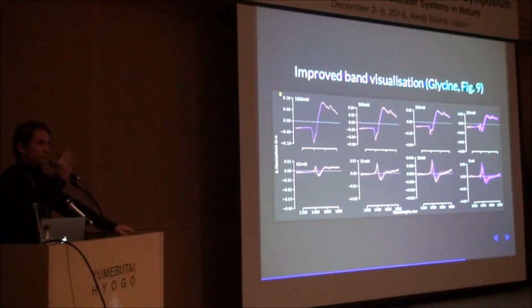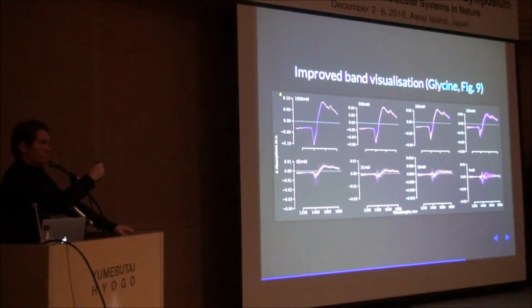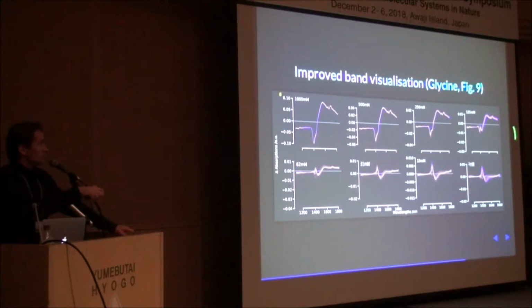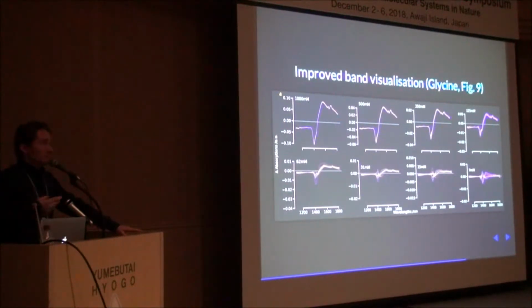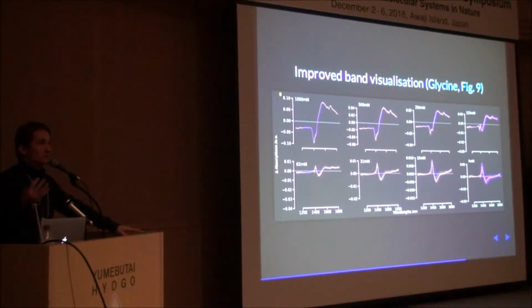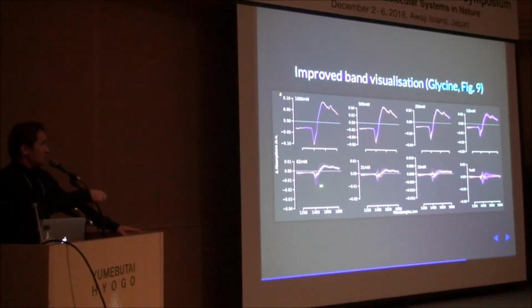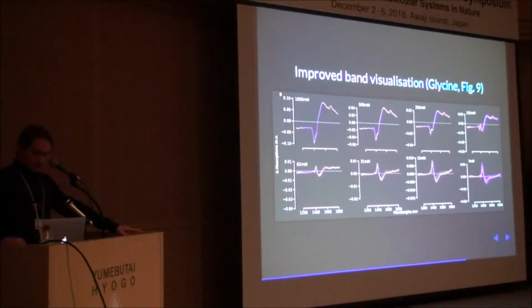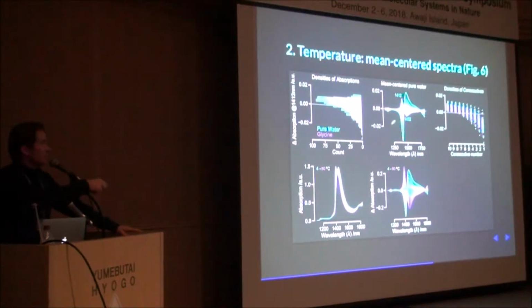You're getting closer to your analyte spectrum, and then after that you're getting away from it again if you continue to subtract. So imagine working with this data. Imagine following a standard scenario where you're taking a lot of spectral water, averaging, and then subtracting. You're going to take one average, or maybe choose a certain consecutive, or just work with all the data. Imagine having all this data overlapped together. And imagine what you will get for all of these concentration levels will look like this.